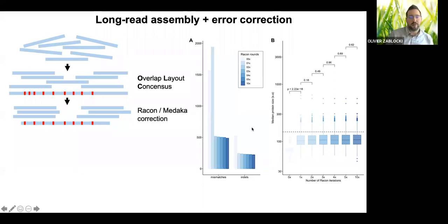And here in the Viromics 2 paper, we show that after 3 rounds, it is enough to significantly reduce the number of errors. So this is the number of errors per 100,000 bases. You can see here that it starts at 1,500 errors per 100,000. That's at 0 rounds, so this is the number of errors that you have in the data before correction.